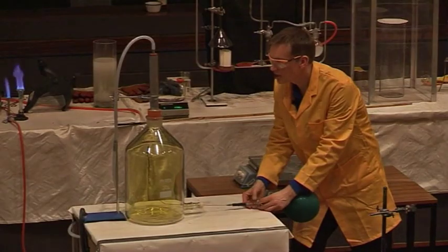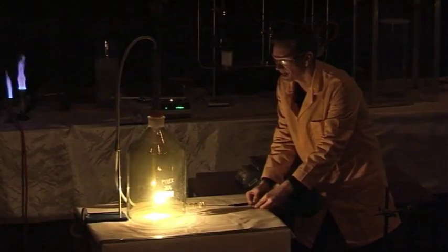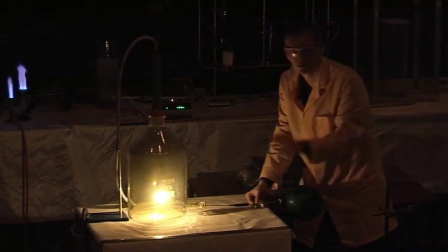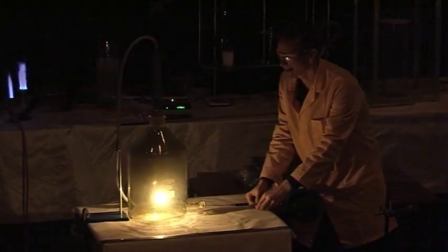I'm going to turn the tap any second and watch what happens. There we are. As soon as the gases mix, as soon as the acetylene comes into contact with the chlorine, we instantly get a reaction. It's burning, so there is no oxygen in this reaction. This reaction is just chlorine and acetylene.